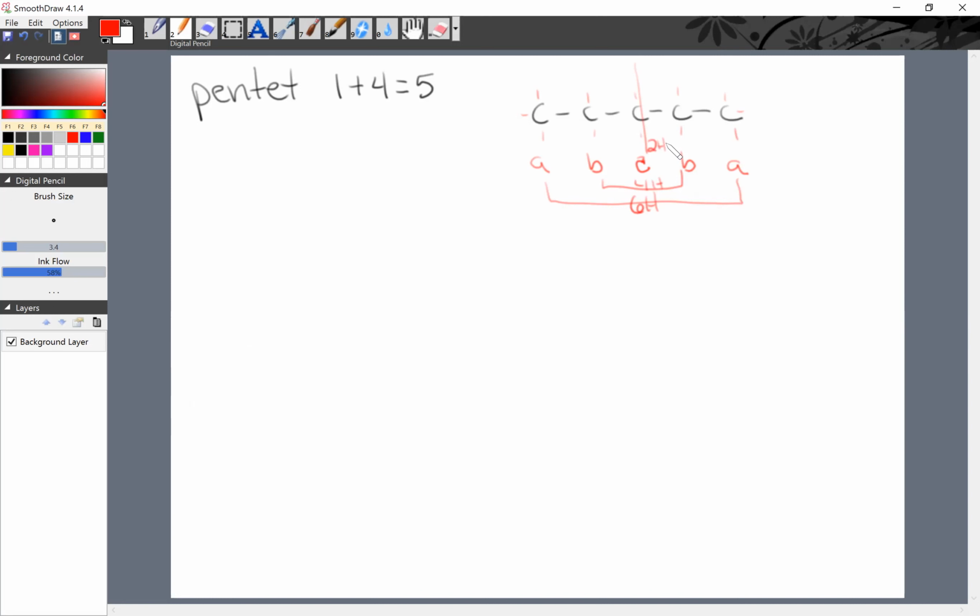And now I need to know how they would split. All right, so this one right here, that's the original peak. Look at anything adjacent, and so this is 1, 2 plus itself. So this one should be a triplet that integrates for 6. And then we'll talk about location in the next discussion.